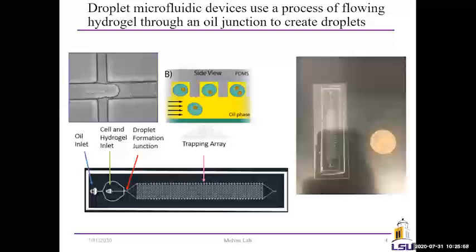The cells then grow in these droplets on our hydrogel scaffold. However, a problem that we face with this is that around 4 days after culturing in the device, our cells begin to suffer and die from lack of nutrients and cellular waste accumulation. The goal of my specific research was to make a cost-effective system of delivering nutrients to the cells growing in the device.